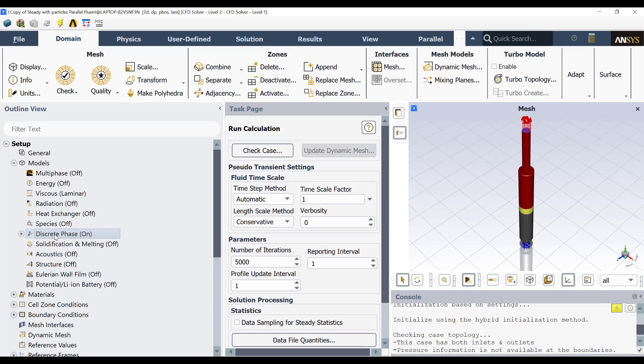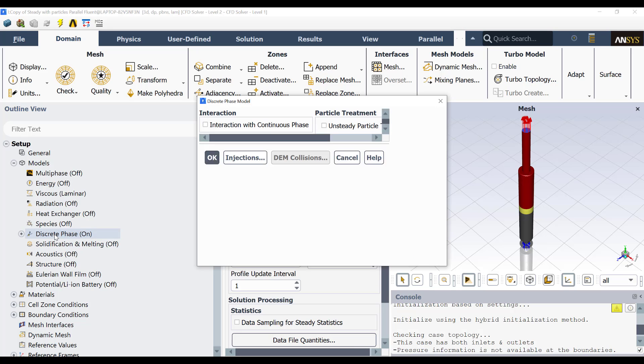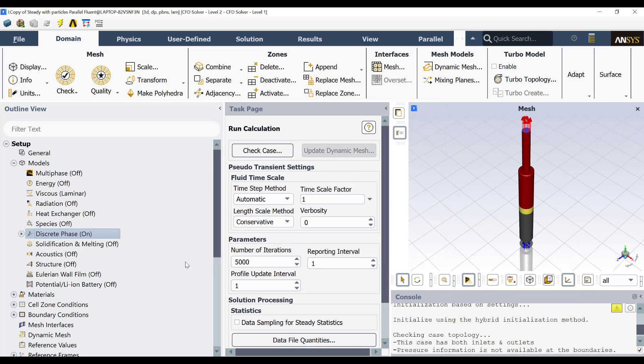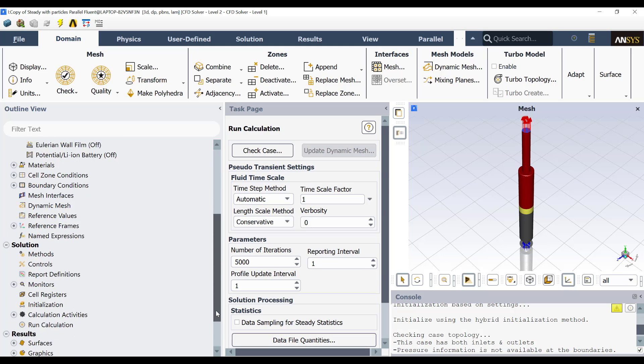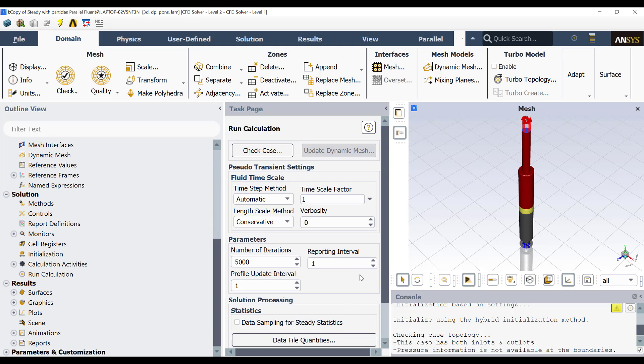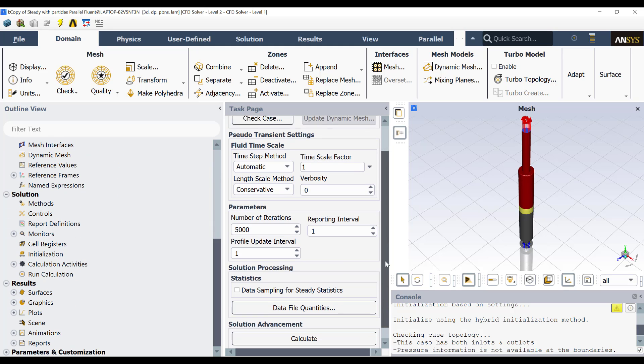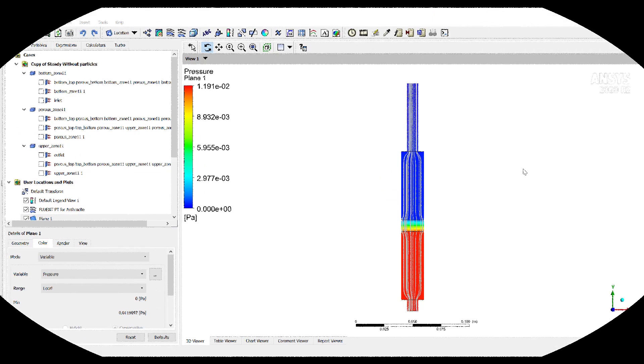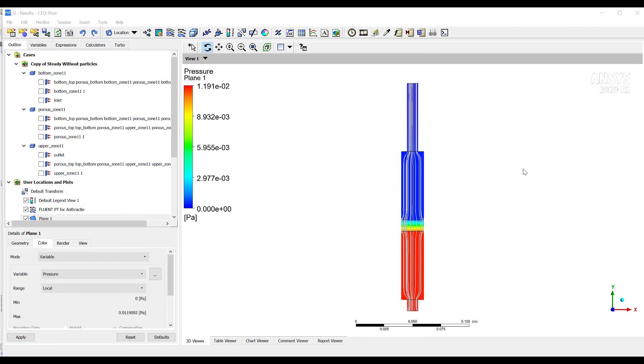Then that's it. If we double click here in discrete phase, we see that we have this value by default. I am not going to change anything here. And that's it. Just running again the simulation using as initial field the flow field obtained in the previous model without particles.